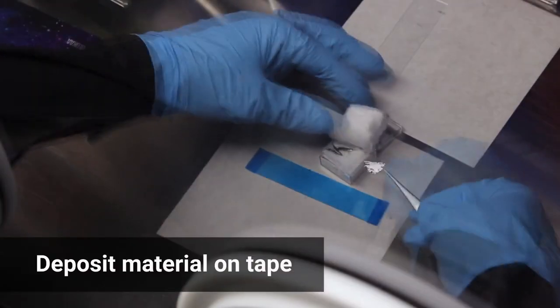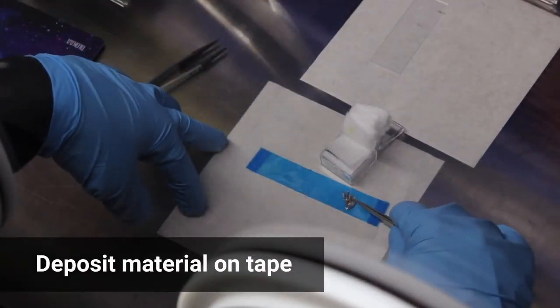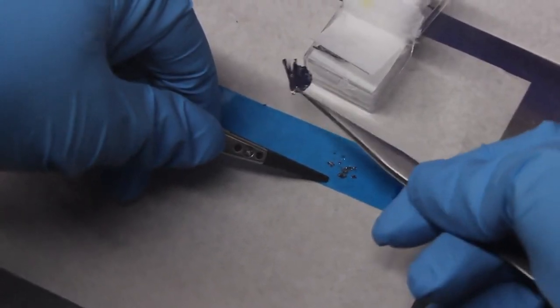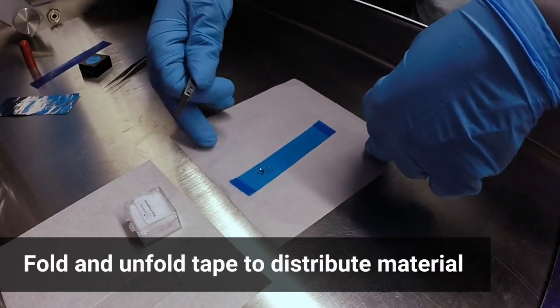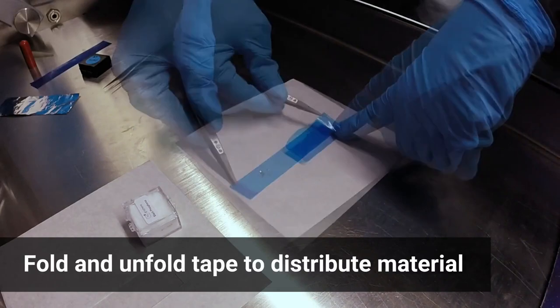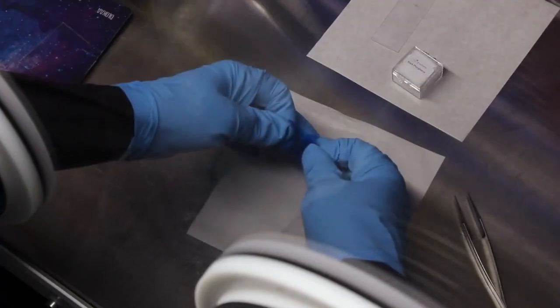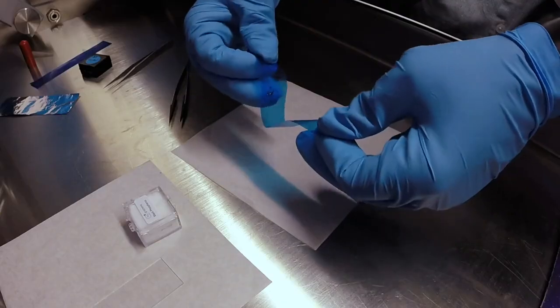Using tweezers, deposit the desired material about one quarter of the way down the length of the tape by repeatedly pressing it onto the tape. Further distribute the material by folding the tape in half, sticking it to itself, and pulling it apart so that the material covers an area of at least 1 square cm.